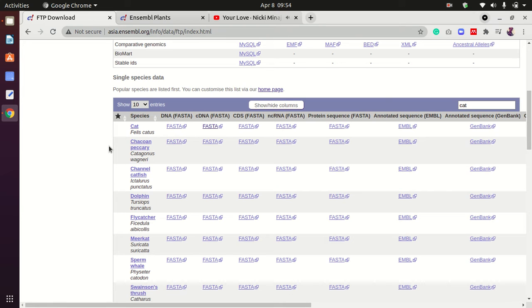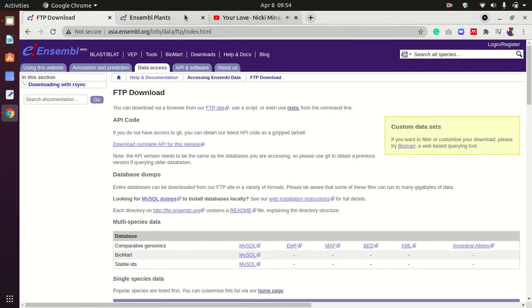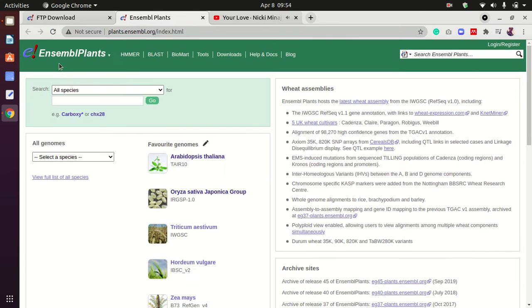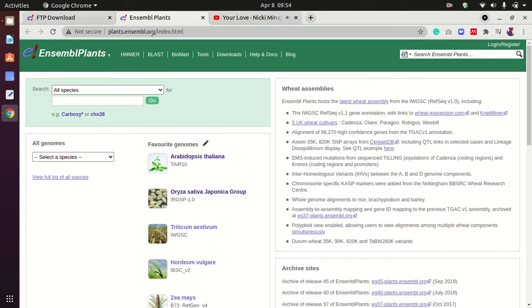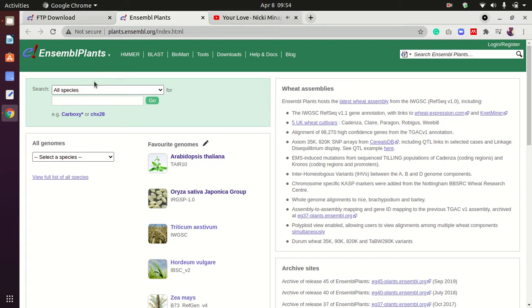Alright friends, today I'm going to tell you how to download datasets from the Ensembl database. We've already opened the homepage of the Ensembl database plant section.